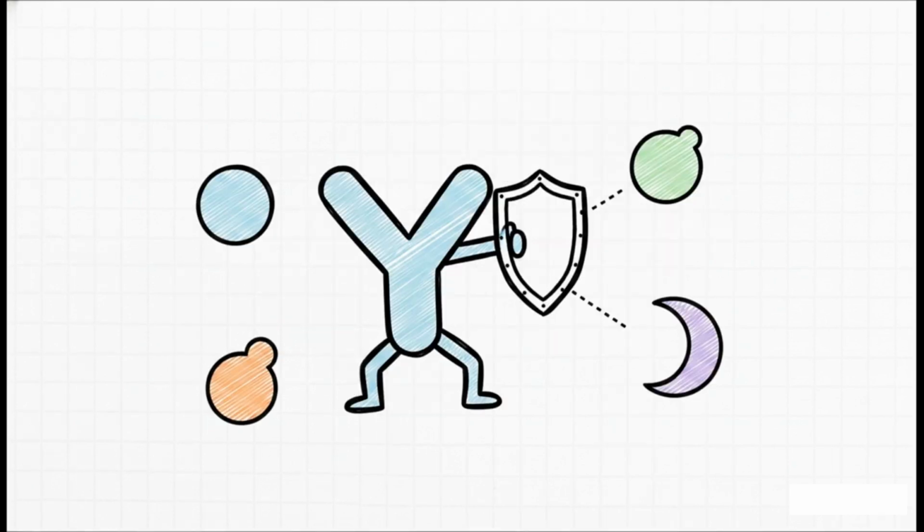Step 2 is to aggressively challenge your antibodies. You need to run a deliberate cross-reactivity panel to challenge the assay against plausible biological interference. Go ahead and spike in homologous proteins, related biomarkers, precursor or metabolite forms, and endogenous binding partners at realistically high concentrations. You have to prove, without a doubt, whether your assay is truly selective for your specific target, or if it's just happily binding to any near-neighbor protein that happens to float by.